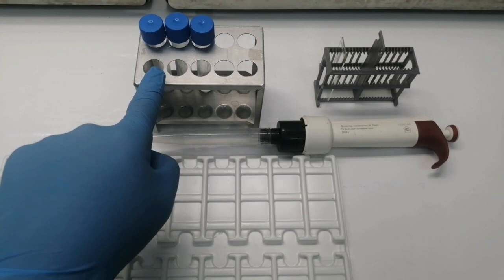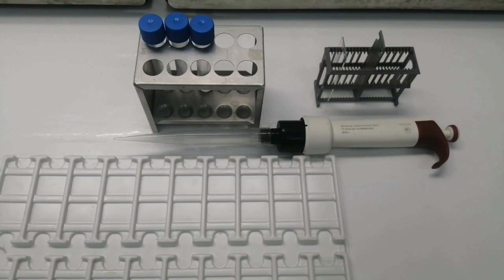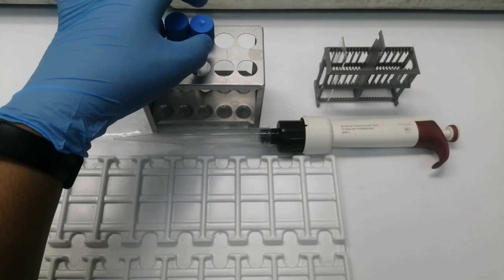After getting the specimens from the patients, we now have these tubes with the saliva and these tissues on the glass slides. We have to prepare these specimens to be able to make the microscopical imaging, to see the results — if there is a relationship between the saliva and gingivitis.